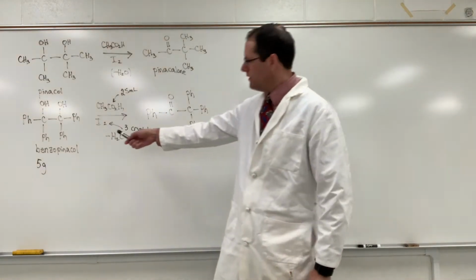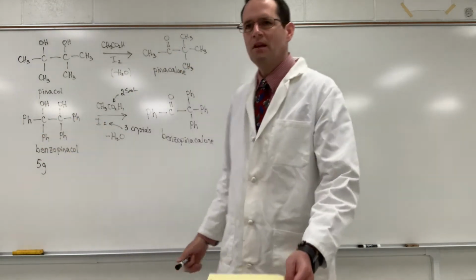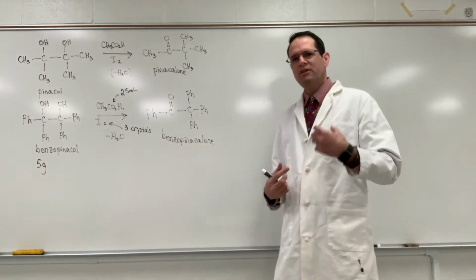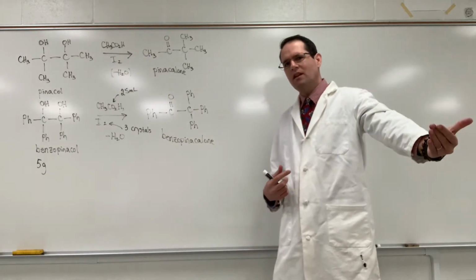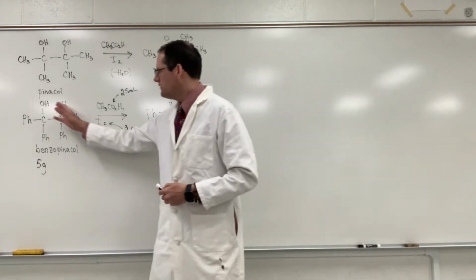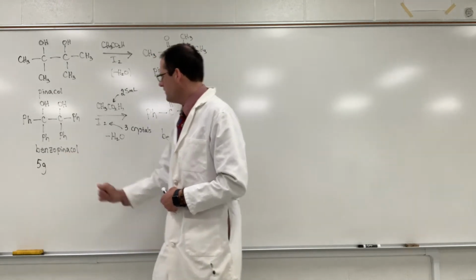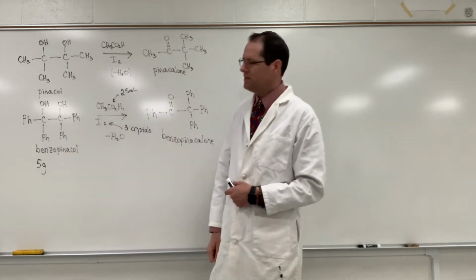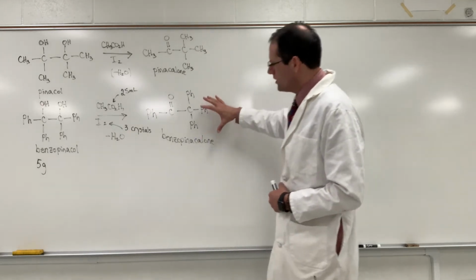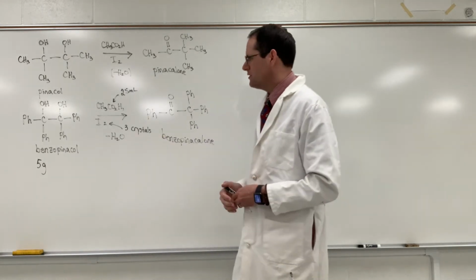Now in the lab, we're going to be taking benzopinacol that we synthesized from benzophenone. Remember, we put benzophenone in isopropanol in the sunlight. We did a photochemical dimerization reaction basically to form this product, okay? So we're going to take 5 grams of that in 25 milliliters of acetic acid with 3 crystals of iodine and form benzopinacolone, okay? Water is going to be lost during the reaction.